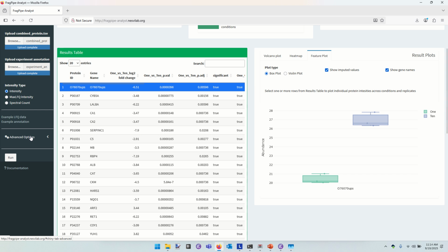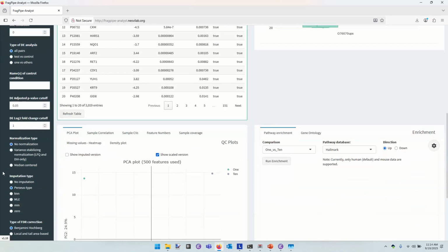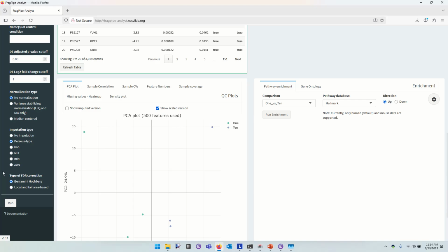I'm simply going to say there are people who understand imputation very well and people who understand imputation superficially. And I'm probably in the superficial category. I know that if you have to rely on imputation, you're already in kind of an awkward place. I don't like having to rely on it, but we're always going to have missing values in quantitative proteomics. You can see that there are 6 different methods used here.